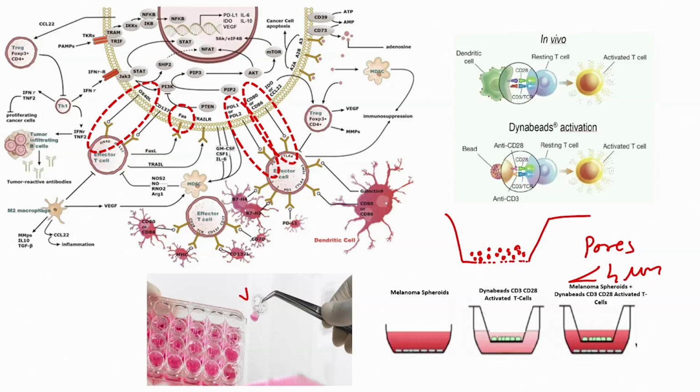Okay. Now, what is the present study? The present study is using a static platform. Okay. In that, what is the mechanism? Melanoma spheroids, let us take an example of skin cancer. So, melanoma spheroids, which we have seen in the last slide, how the spheroid looks like, are placed into the matrigel, right. This red one is matrigel.